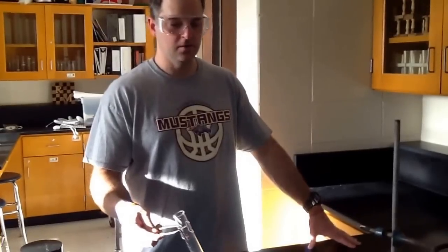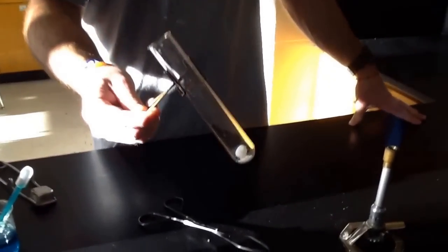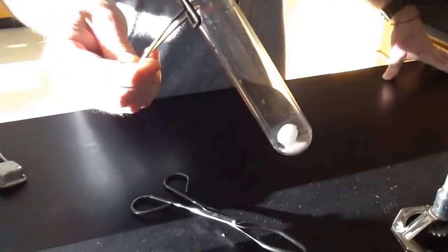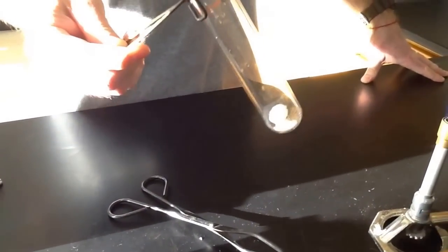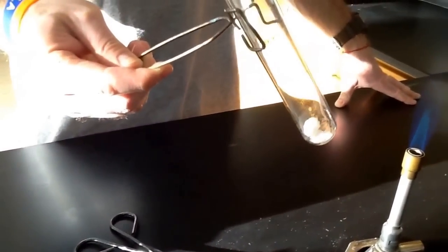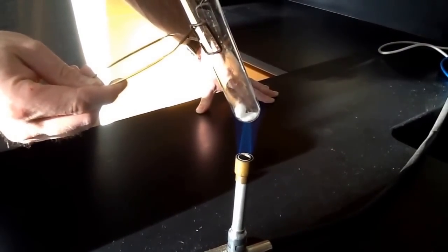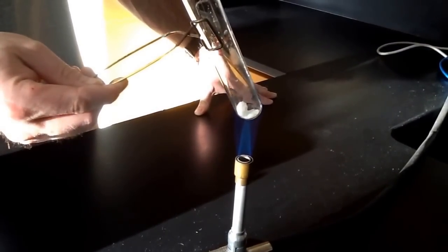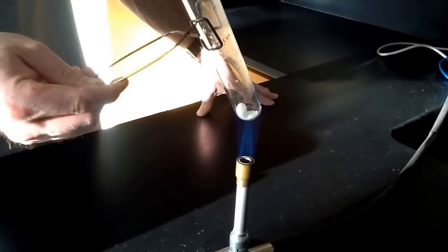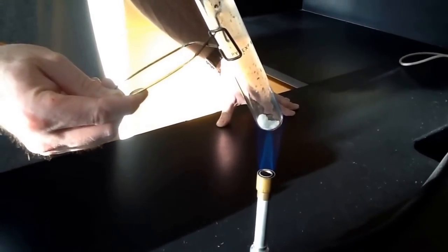All right, everybody. We're going to do another reaction here. And so what we have in the test tube is just some ammonium carbonate, just a white crystalline powder. It's got a pretty good odor to it. So we're going to heat this up. And so this is another decomposition reaction. We know that because you only have one reactant. If you only have one reactant, the only thing you can really do is break down.